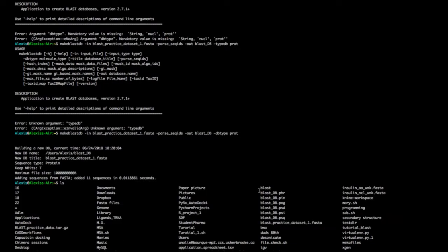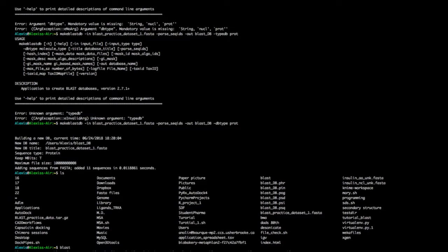We'll keep them in the home directory for easy access, with no long file names — a nice, clear view. Now let's run BLASTP by pressing up to recall the command and checking with the -h flag to see what options we need.